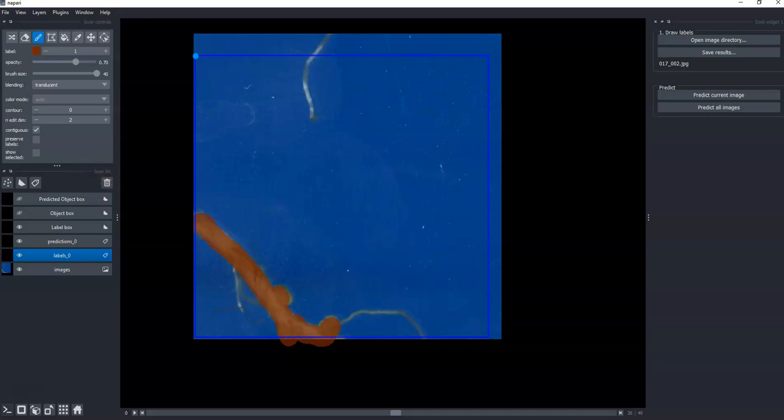And if I was going to come up with a neural net, a trained model I wanted to use long term, I would take much more care doing the labels. Maybe you'd spend even days or a couple weeks doing it.